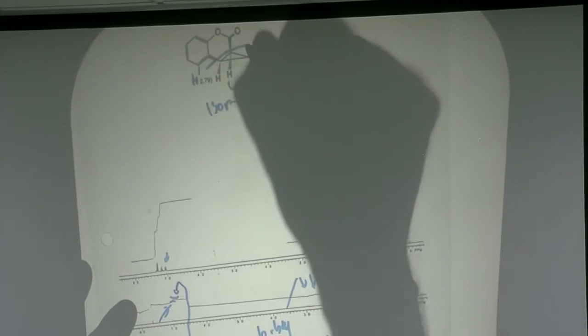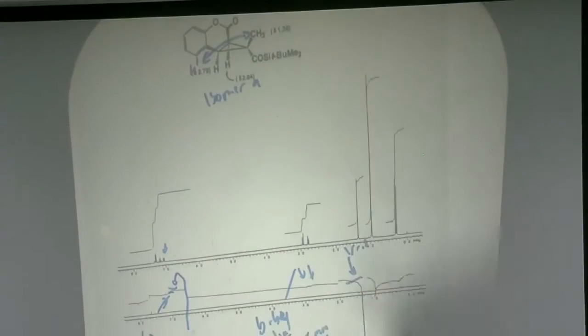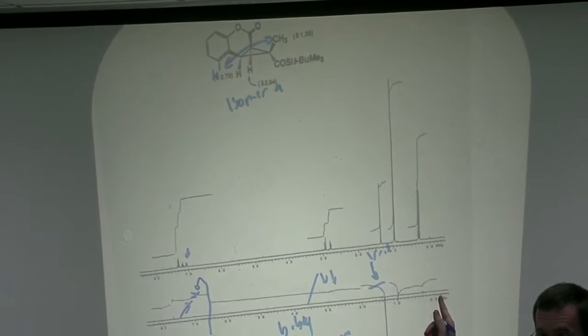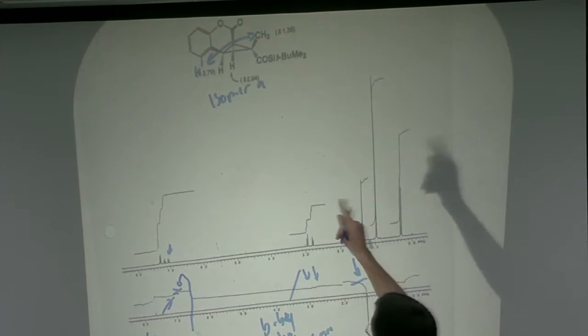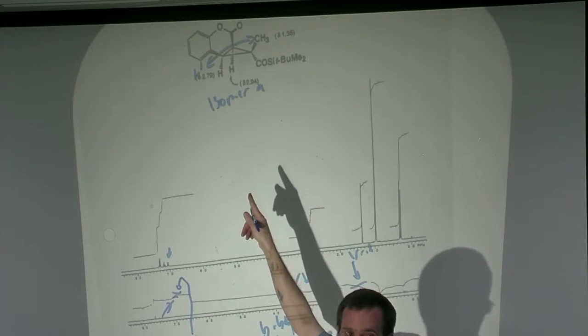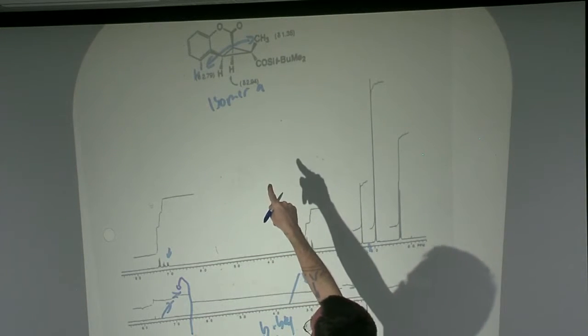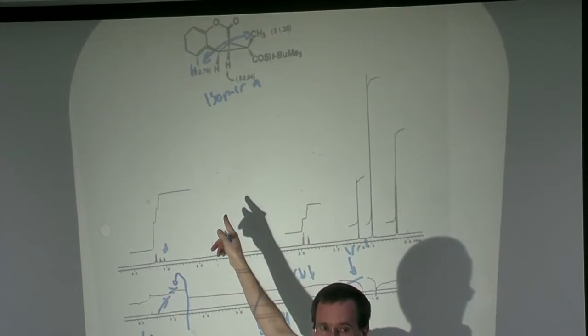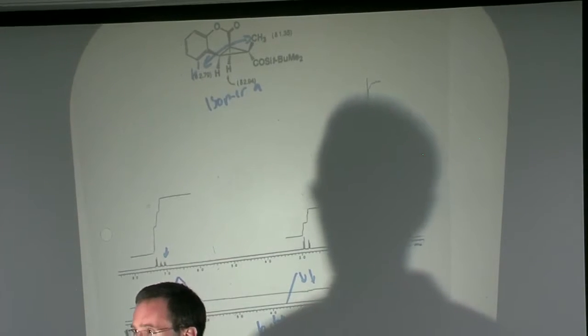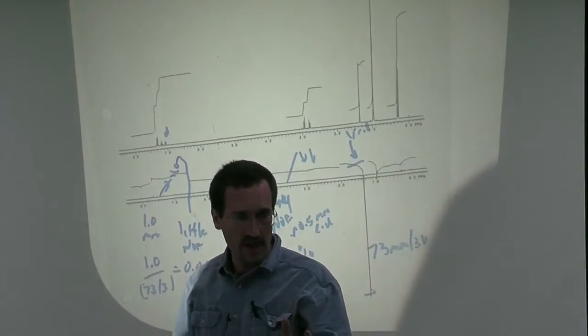So, in other words, if I only had this diastereomer, I wouldn't want to assign it on the basis of that NOE, because we're seeing a little NOE between the cis-phenyl group and the methyl group, and a little NOE with those trans hydrogens and the methyl group. But I'd at least be able to look at this spectrum and say, whoa, pull myself back.